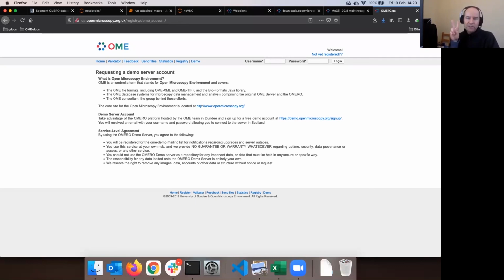Okay, so I hope that I made clear those two special cases of the training server and demo server. But the non-special case, which you will hopefully pursue at McGill, is what I was talking about in the first part: the responsibility, the storage space, etc., will be on the part of McGill.